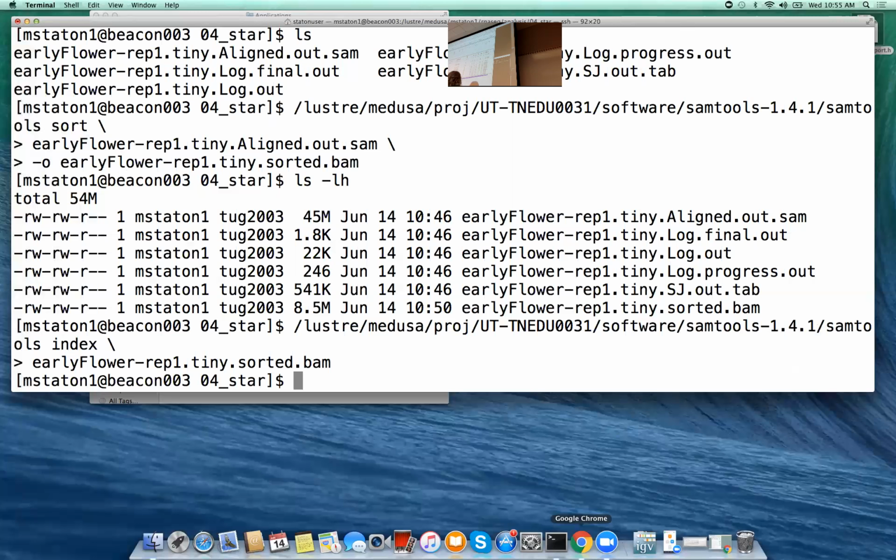This exon looks very robust, right? It starts here and ends here, and indeed all of our reads map to that exact location, which makes sense. And same for this exon, that appears to be very robust, and these other exons. So this just gives you an idea of whether your reads are mapping to genes. Is all of this making sense?